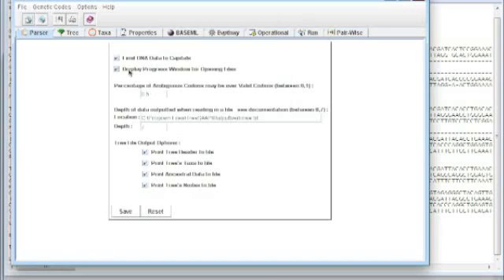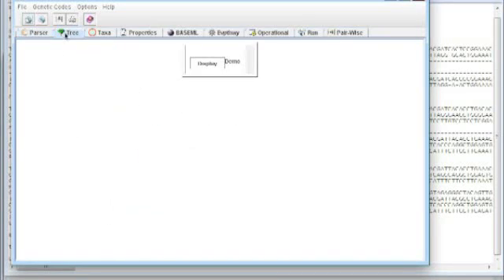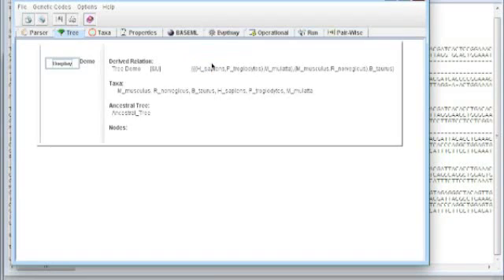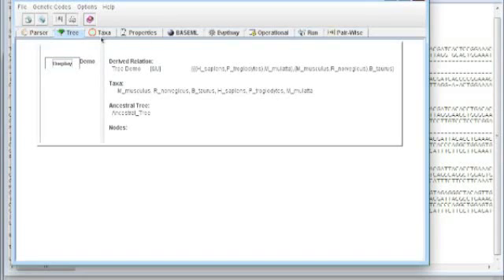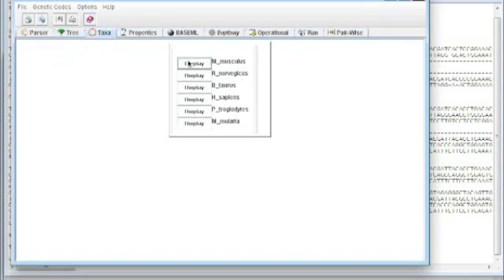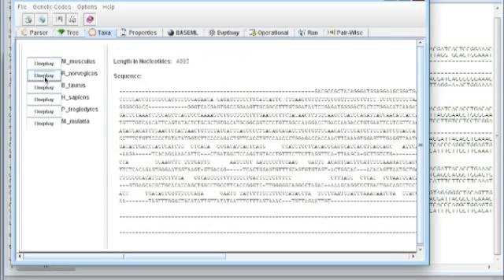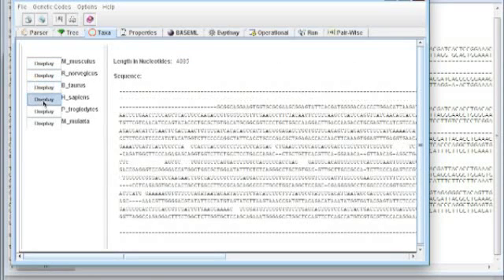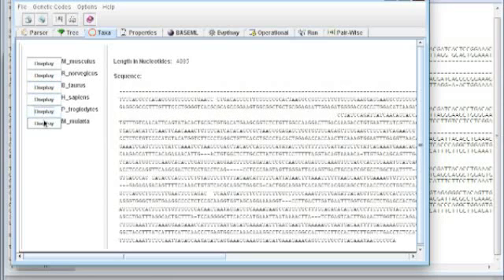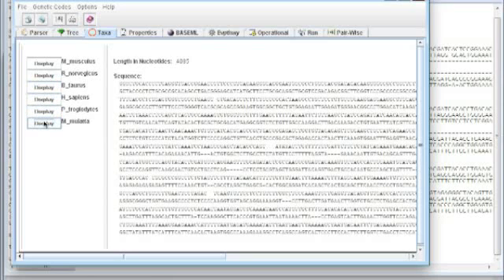And then to check, you have to check to make sure that everything went well. There aren't really any error warnings at this point. So here we see that I named my tree demo and it's right there. Click display. It shows that we have these taxa. One, two, three, four, five, six. It got all six taxa. And we can also, if we click on this, we can see that it indeed was able to find the sequence. So that's a good thing.